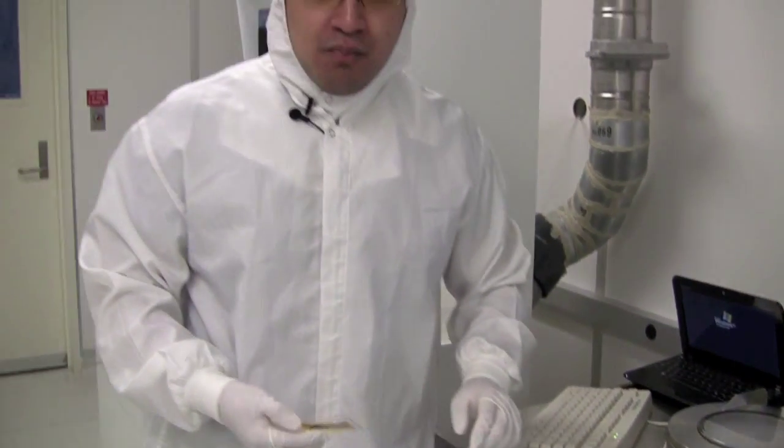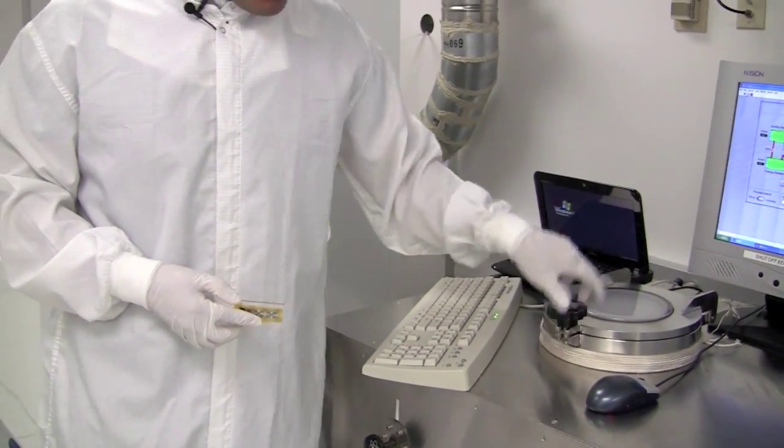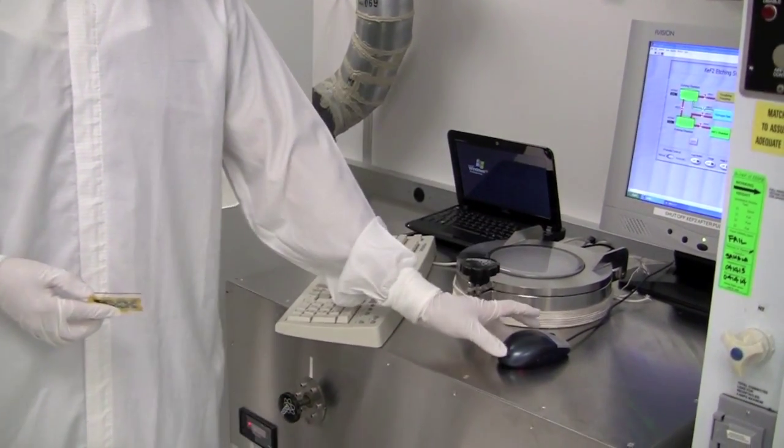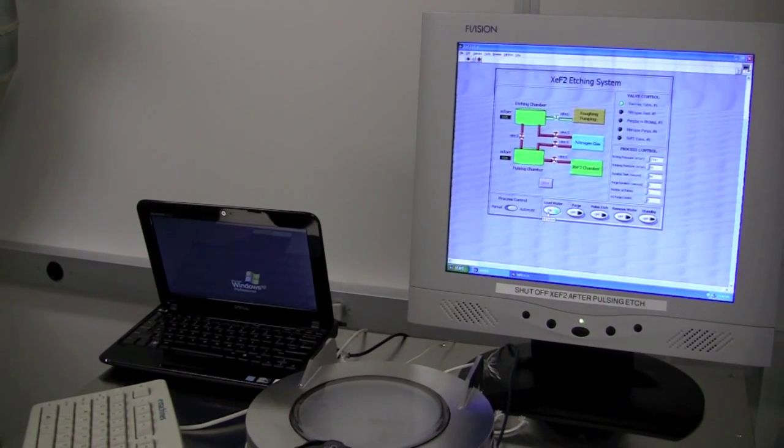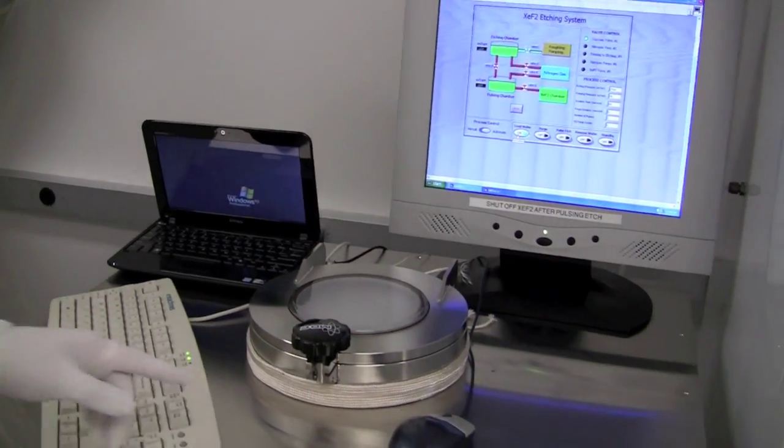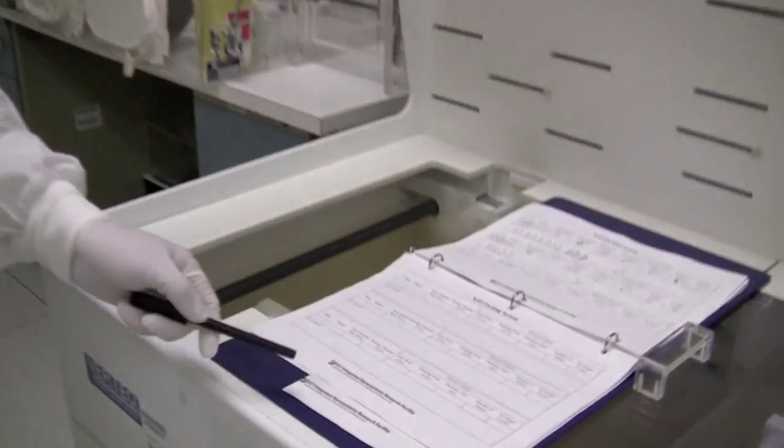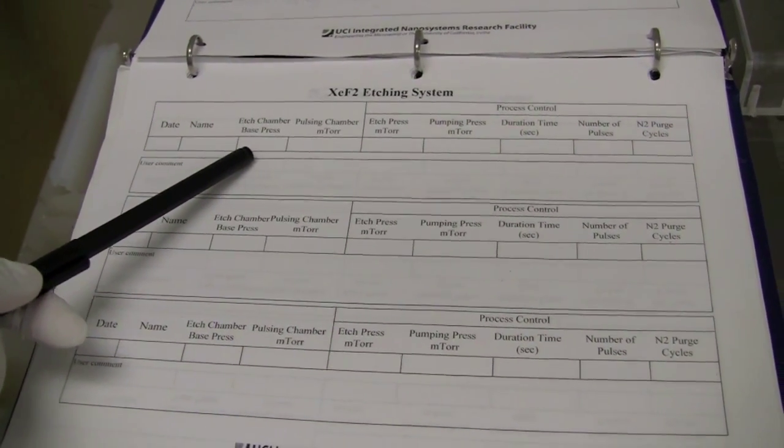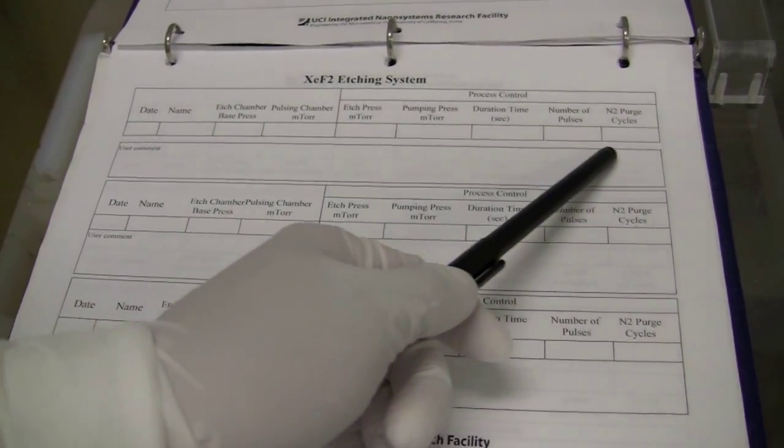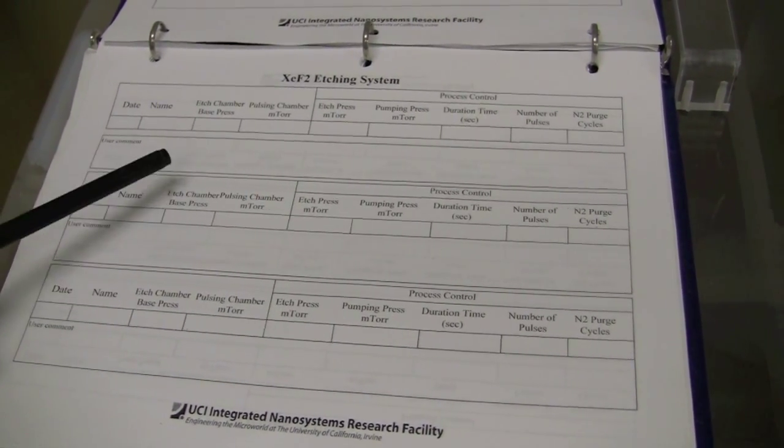Now what I would suggest is taking your sample to a microscope and just visually seeing if it's done. If it's not done yet, you can put it back in and reload the sample like before. But if you are done, what you want to do is just simply load it with no sample inside, fasten it again, and you want to hit load wafer on the screen. It will pump down like before, and you want to wait until this reaches 50 millitorr again. But while we're waiting for this, if you're done, you want to be sure to log everything you did in our logbook. So this is our general format. We have a date, we have name, the etch chamber base pressure is the pressure you saw before you did anything, you can ignore this parameter. And here's your recipe. So you want to record the recipe and make any notes. If you had any problems, or anything like that, you want to put it here. If everything was okay, just write okay, and that's good for us to know.